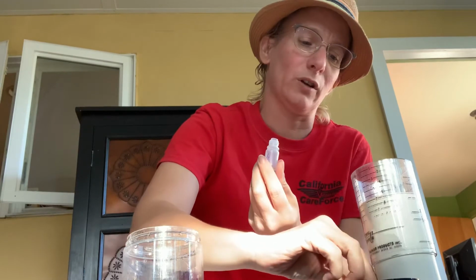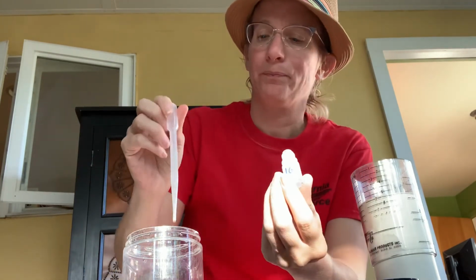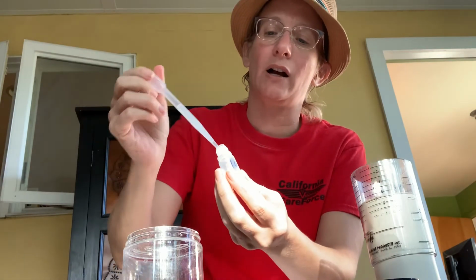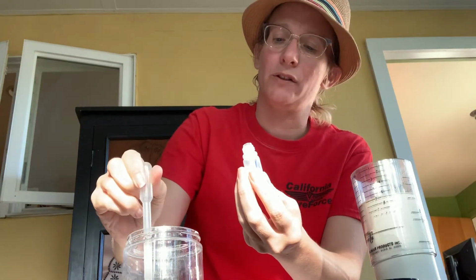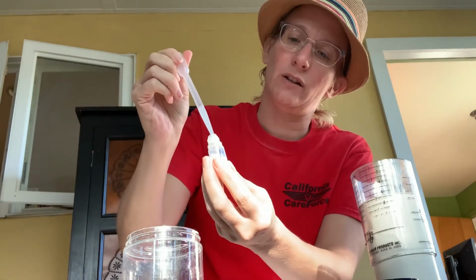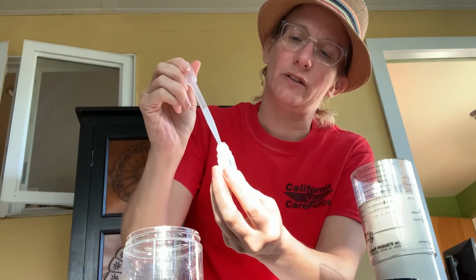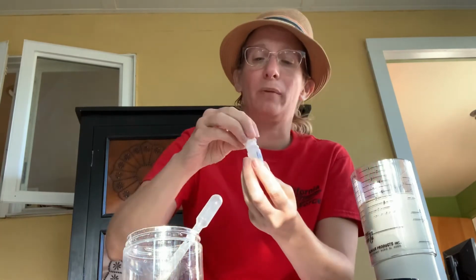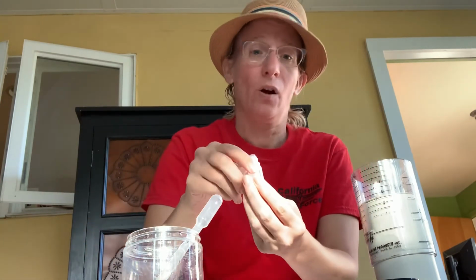Again, this is a really great test to do if you have several hives to do at once. So I draw this up. You can measure this using like a syringe. I happen to know that this holds 5 milliliters in here, and just like that. So what I did is I made a whole bunch of these and I just took them out to my apiary. I didn't actually see any signs of Foulbrood, but I ran the test anyhow, just to give myself a little extra peace of mind.